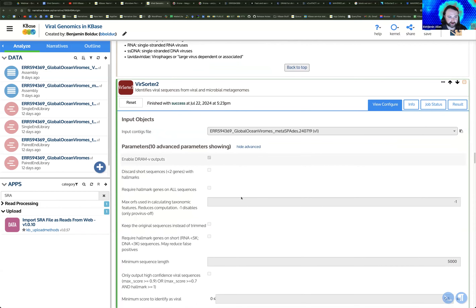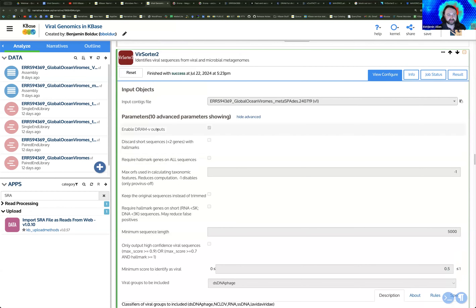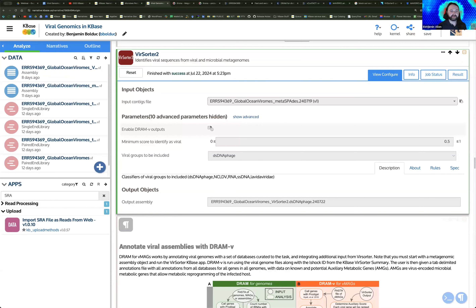Just a couple of things to note: these are the default parameters and they generally work pretty well. You can select the type of viral group you want to include — you can only select one at a time, so if you want to run additional groups, you'll have to create multiple copies of the app. One parameter worth noting is 'Enable DRAM-V Outputs.' We'll show DRAM-V in a bit — it's an annotation tool if you're trying to annotate AMGs on your viral sequences, and you'll need to select this option.